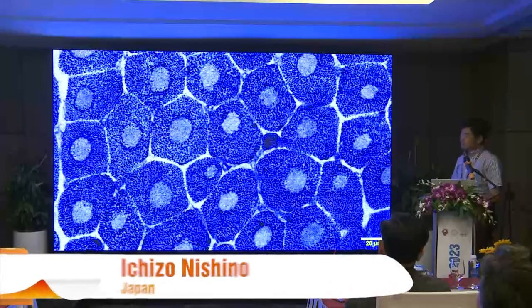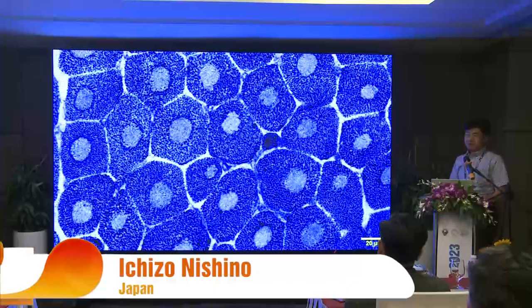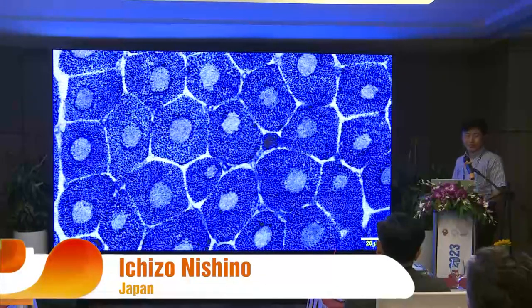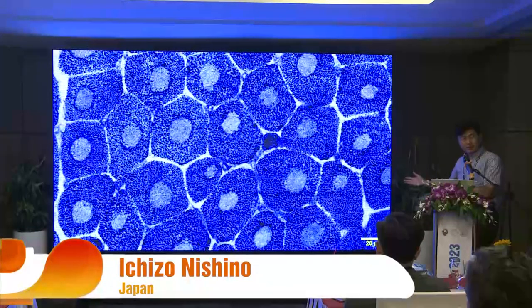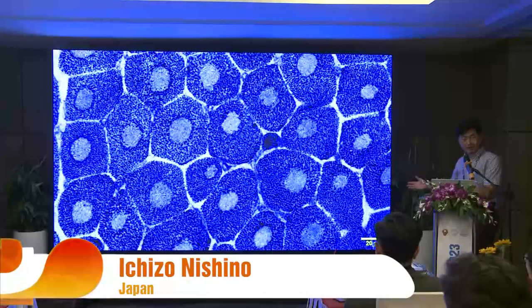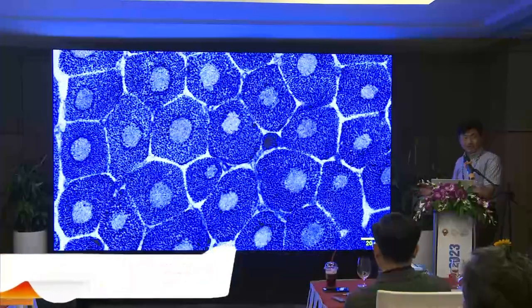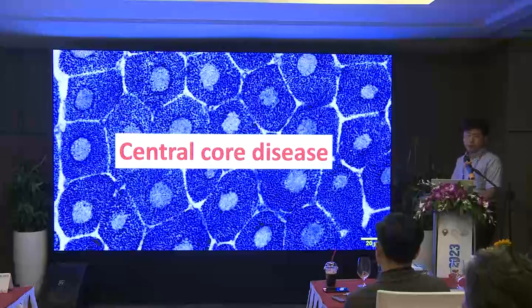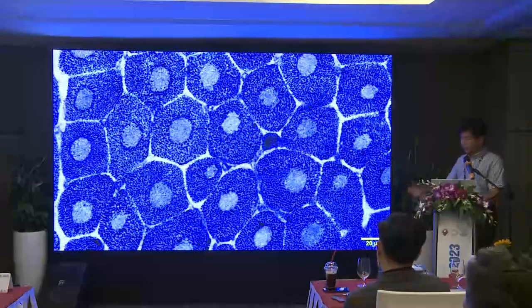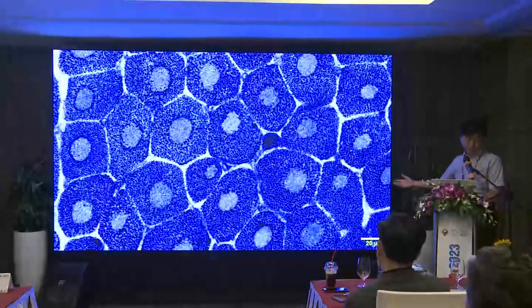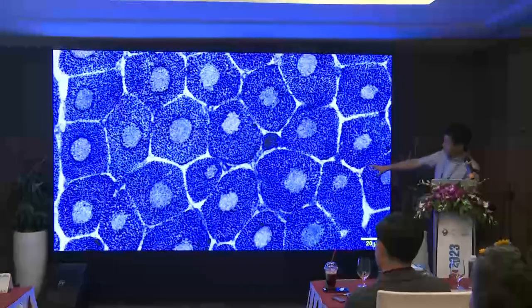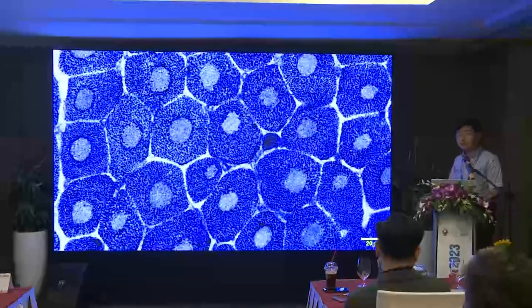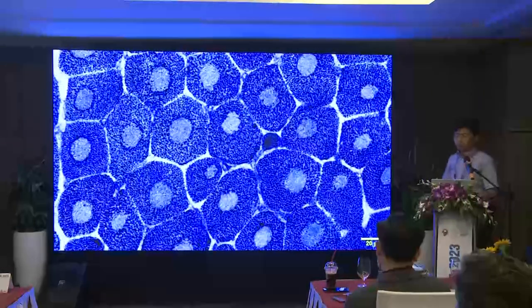I'd like to start with this picture. Do you know what it is? This is central core disease. You can understand why it's called central core disease because in the center of muscle fibers, you see something round in shape. This is why it's called central core disease.